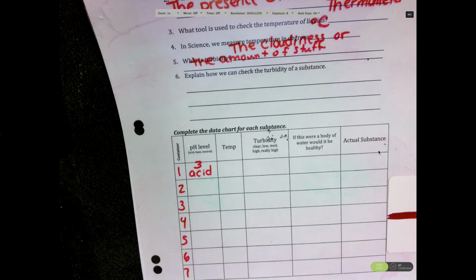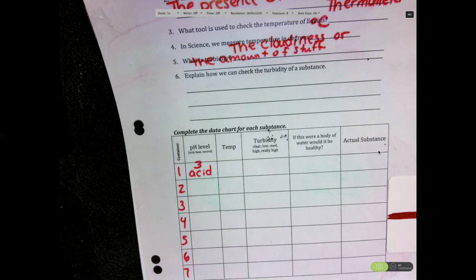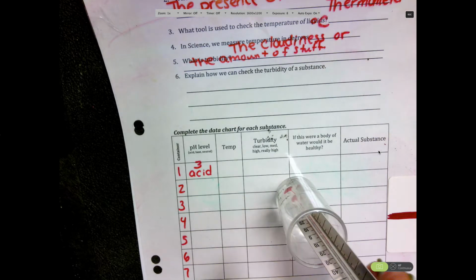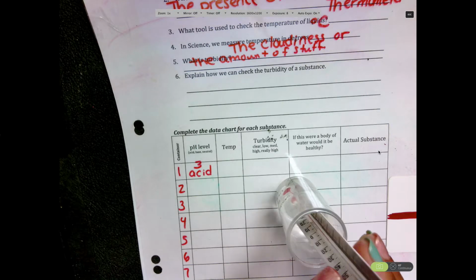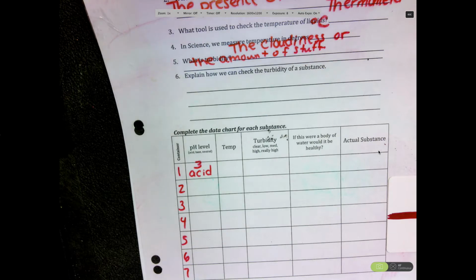All right? For the temperature, I'm using a thermometer. It's hard to see on there, so I will tell you. The temperature is 20 degrees Celsius.